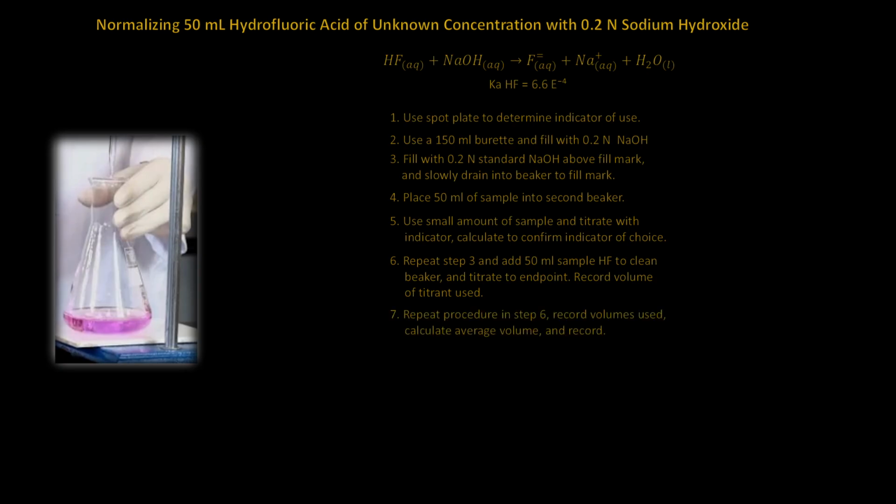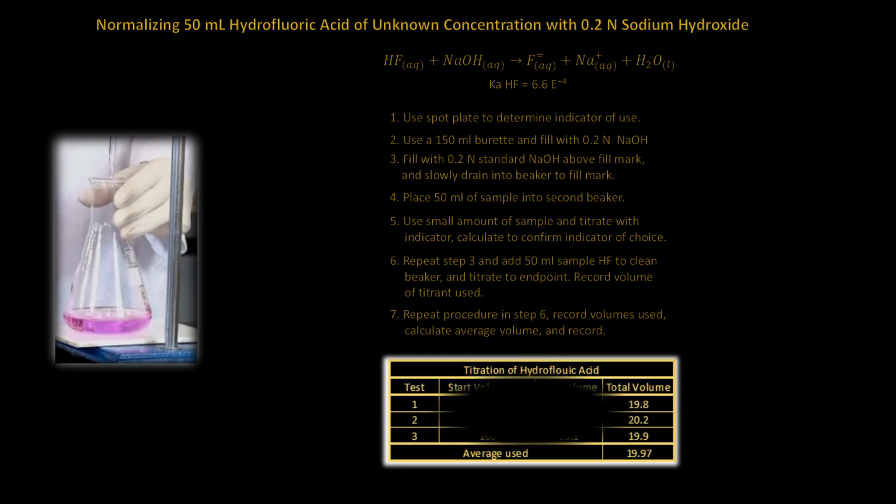Repeat the procedure in step 6 three times and calculate the average volume of sodium hydroxide used to titrate to the endpoint and record. This information is used to calculate the concentration of the hydrofluoric acid in solution.